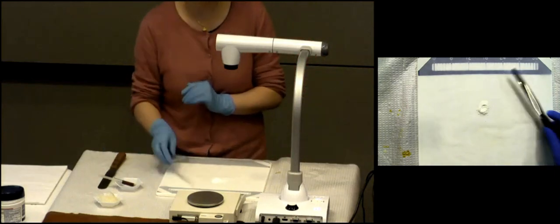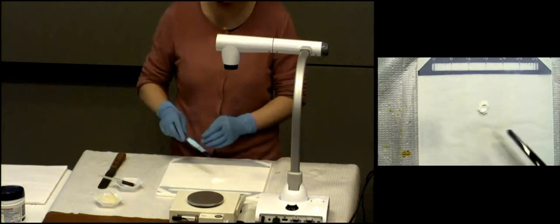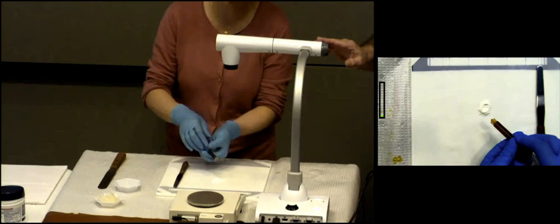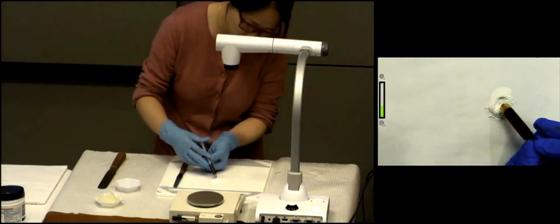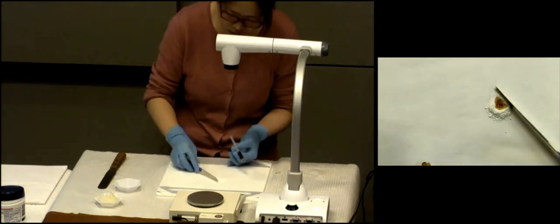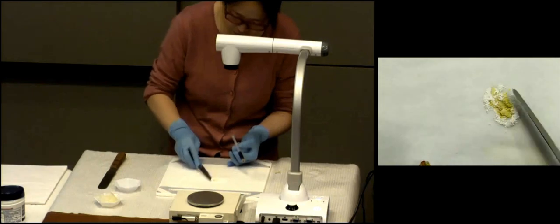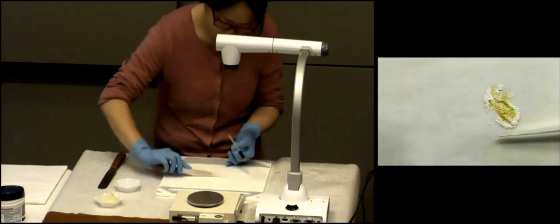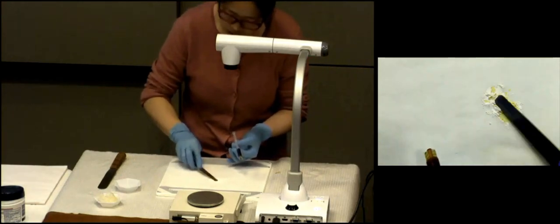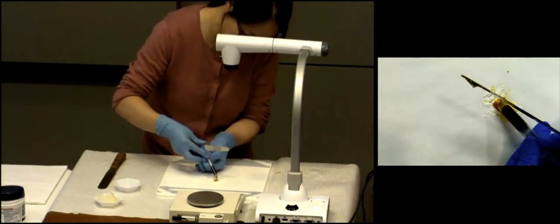For the levigation here, I transferred my hydrocortisone powder onto the parchment paper. I'm going to make a little dip. We are going to use LCD for levigation. So I'm going to add a little bit there and use my small spatula to do the levigation here. All right, clearly I still have a lot of powder, so I know I'm not there yet. We will tell you what it means when it's finished.